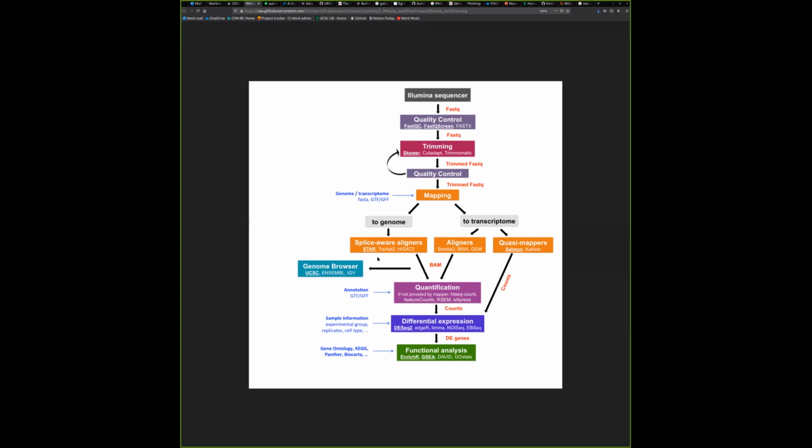So again, you can download all of these tools and software if you want to give it a try. It's not necessary for this workshop and for whatever we're trying to do today. But I hope you have at least three tools on your computer: FastQC, Trimmomatic, and Kallisto, to follow through with today's workshop.